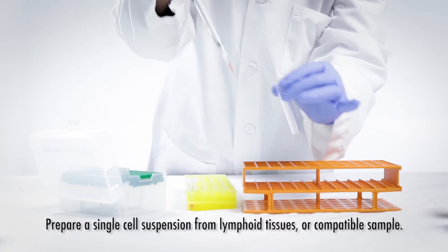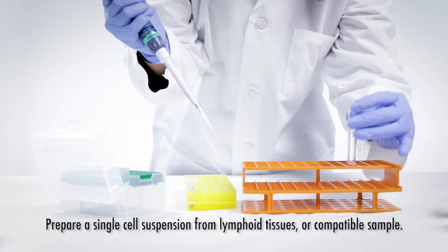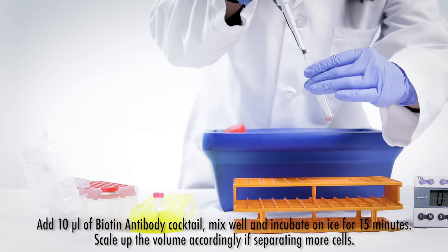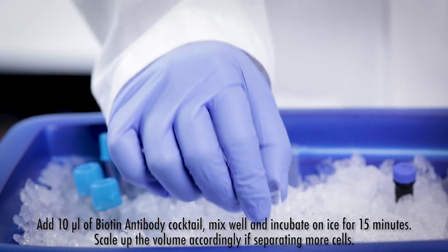Prepare a single cell suspension from lymphoid tissues or compatible sample. Add 10 microliters of biotin antibody cocktail. Mix well and incubate on ice for 15 minutes.